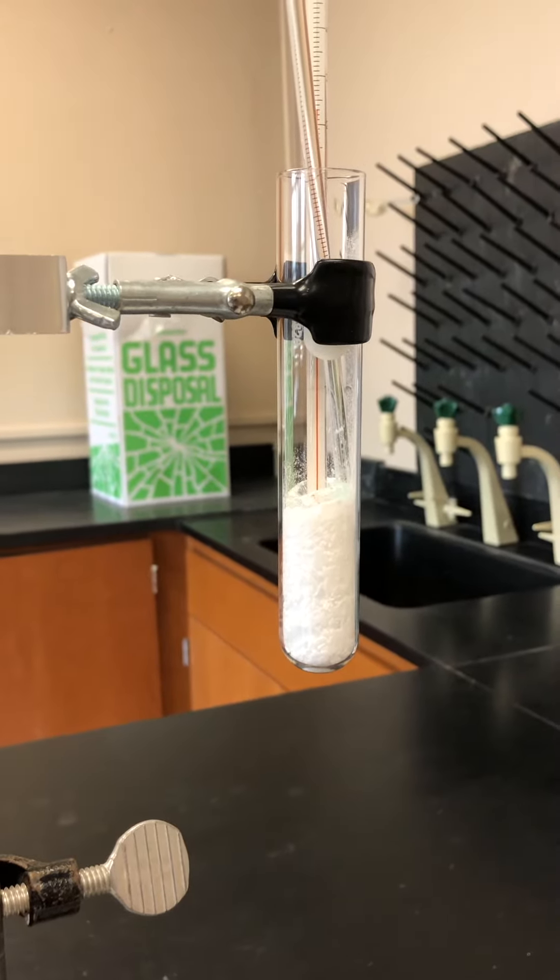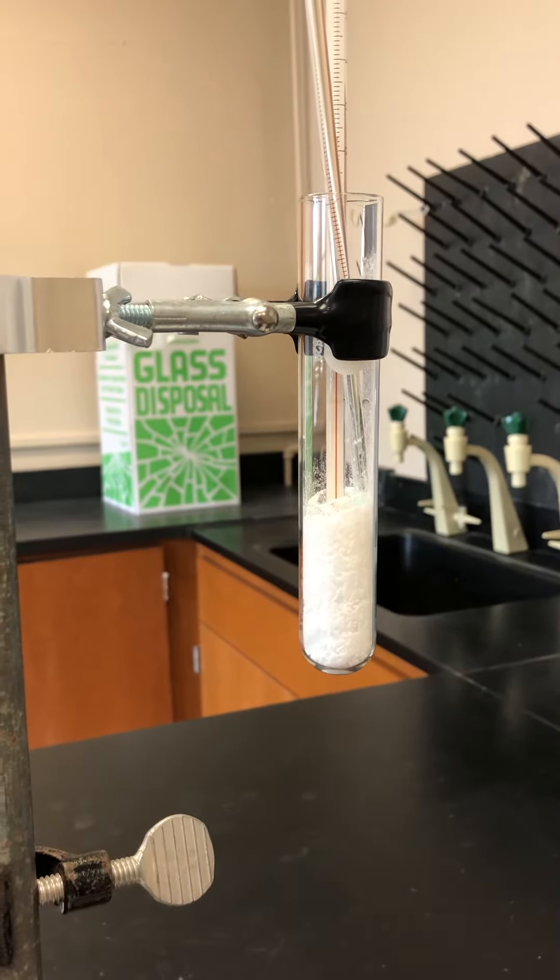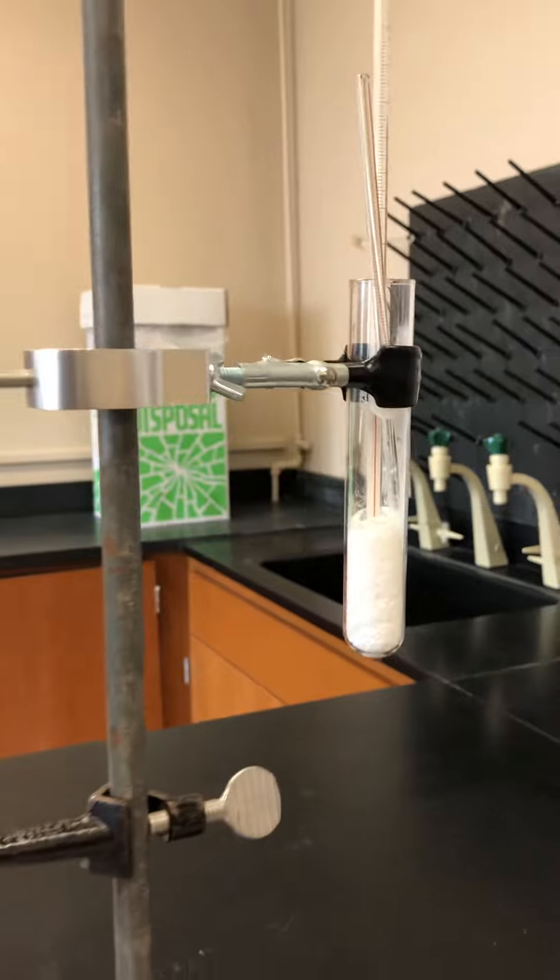It's going to freeze at some temperature above room temperature, and then we're going to make a graph and we'll be able to determine what the freezing point of the solid is.